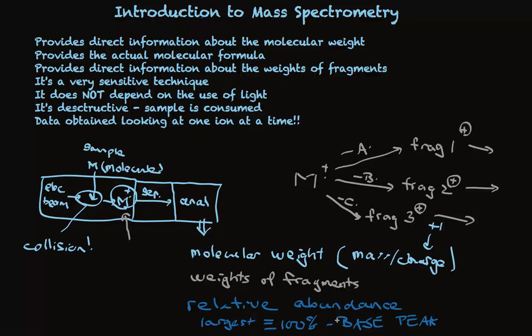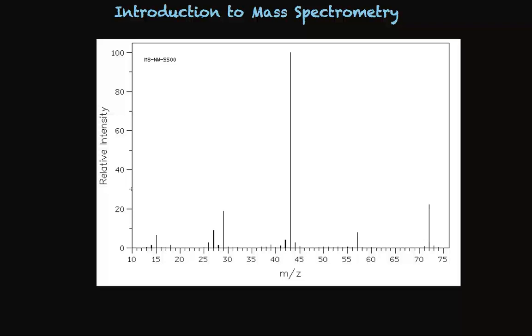Let's take a look at one. This mass spectrum is taken from a database that's on a server kept in Japan. Extremely useful. It goes by the acronym SDBS. These organic spectra can be found on the web, and access is free. I highly recommend using this if you need spectra for organic compounds. They have many, many in there.